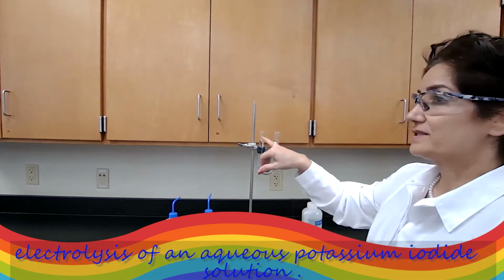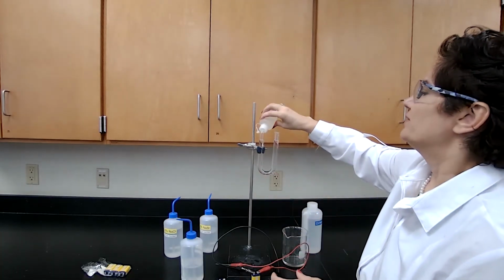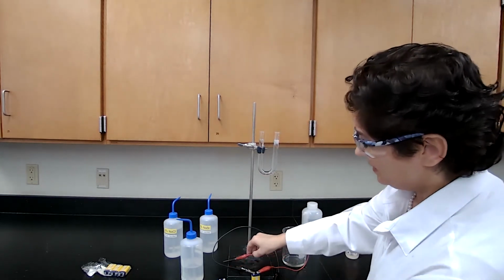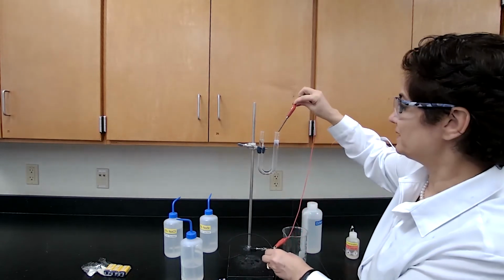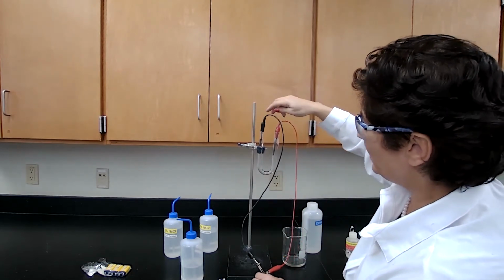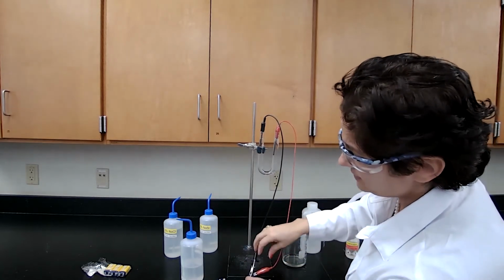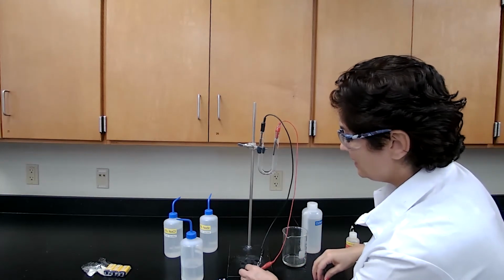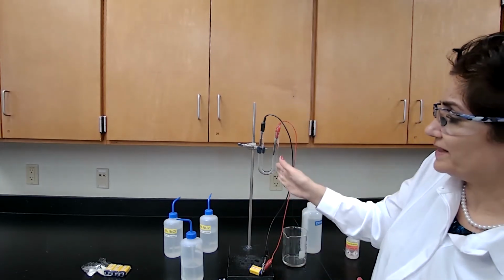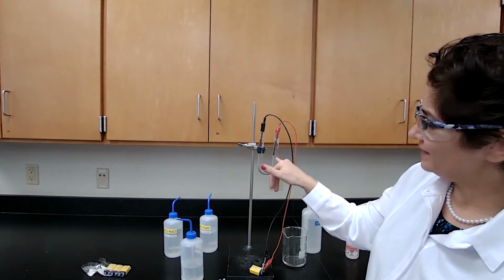Okay. Next solution, we have potassium iodide, adding phenolphthalein. The purpose of adding phenolphthalein is to see if water is being reduced. If water is being reduced, we get a pink color appearing on the cathode side. And now that we talked about the negative and positive sides and that reduction took place on the right side, that's where we look for the pink color.